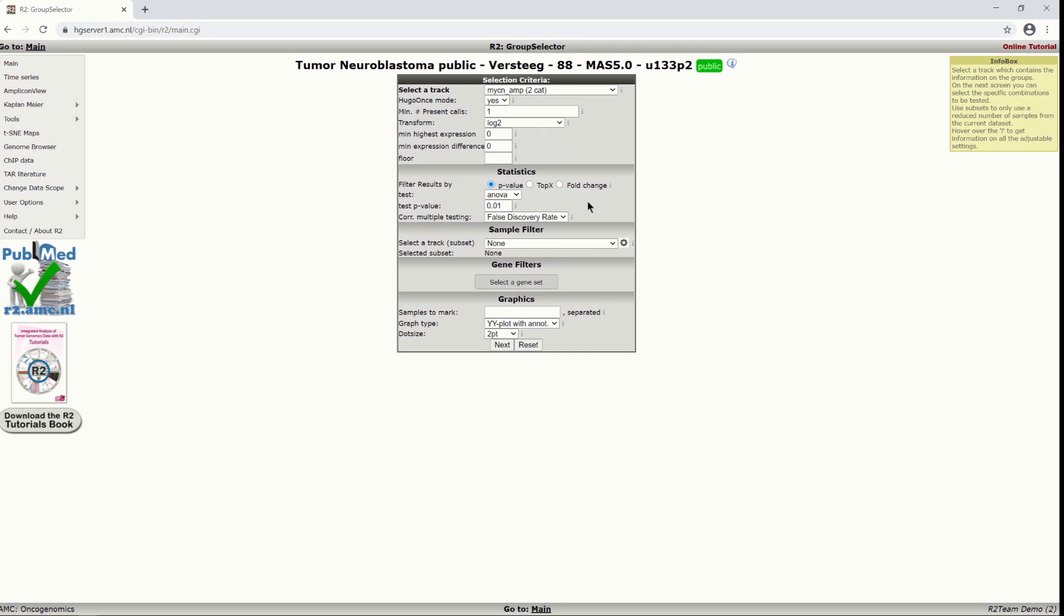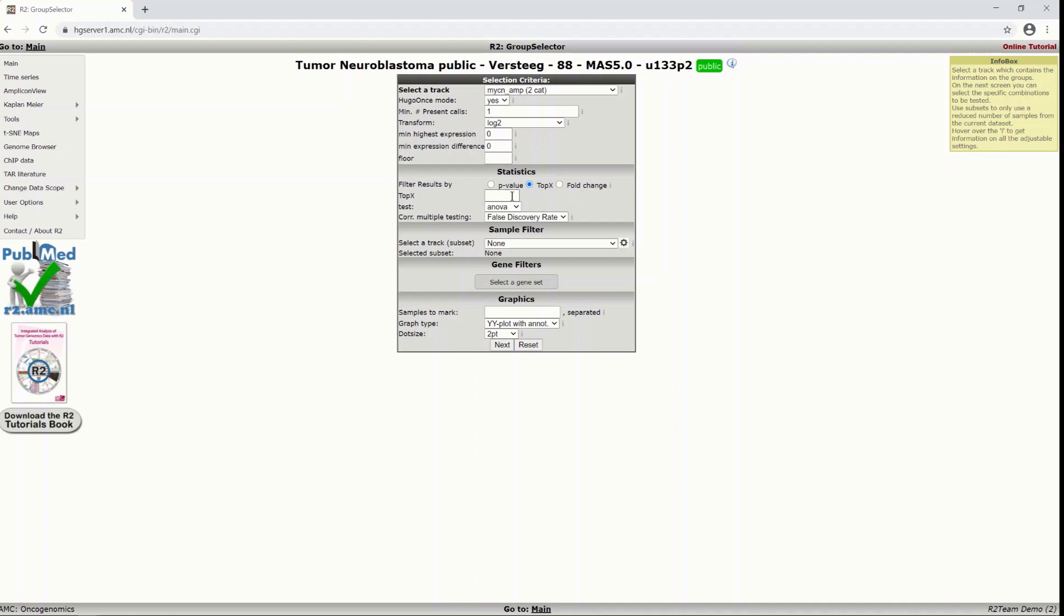Sometimes if you don't find an immediate result with this module you might want to set less stringent requirements. For instance by just asking for the top differentially expressed genes. So here you can fill in a number say 20 or 100 and you get the top 100 differentially expressed genes. Also you could use the fold changes but we will stay with the p-value.